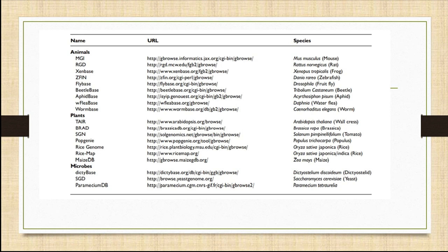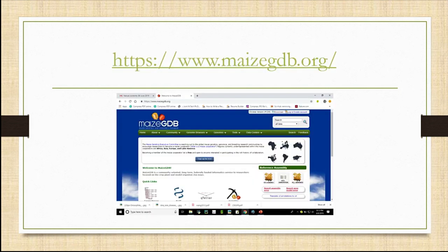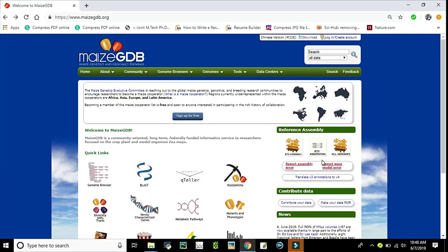genome browser is MaizeGDB. In the following, we will discuss the resources in MaizeGDB and retrieve SSR markers from MaizeGDB. This is the link to MaizeGDB. Clicking the link will lead us to the home page of MaizeGDB.